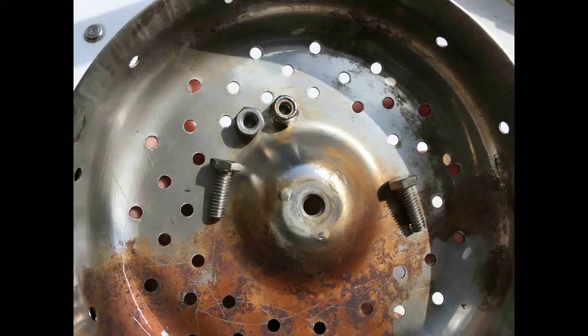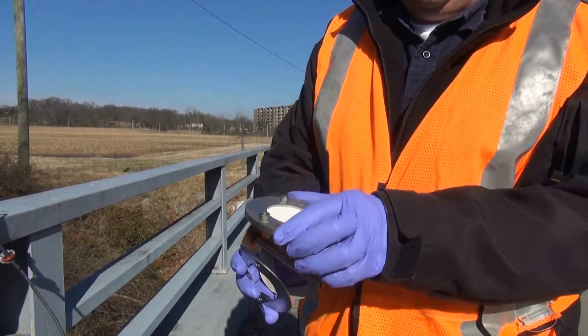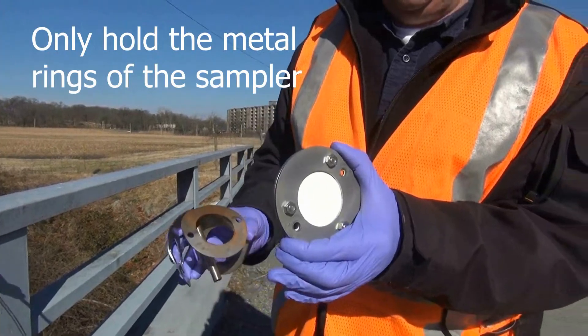Finding the right way to hold the hardware in the cage lid is a good way to not lose anything. Remember to only hold the sampler by the metal ring.